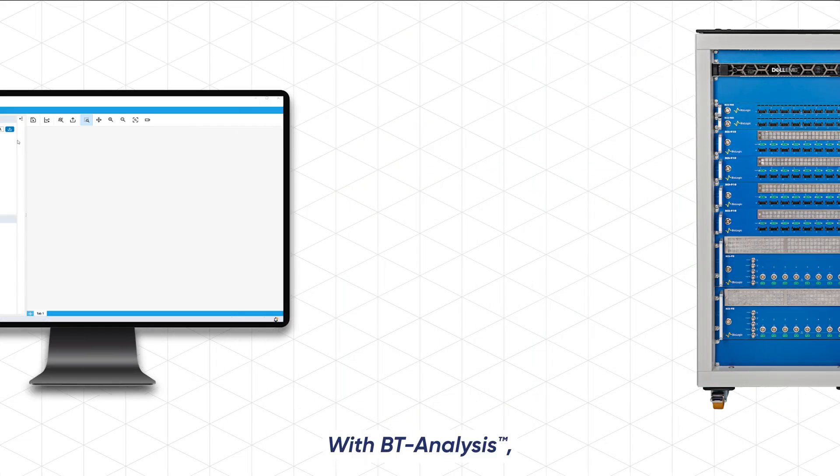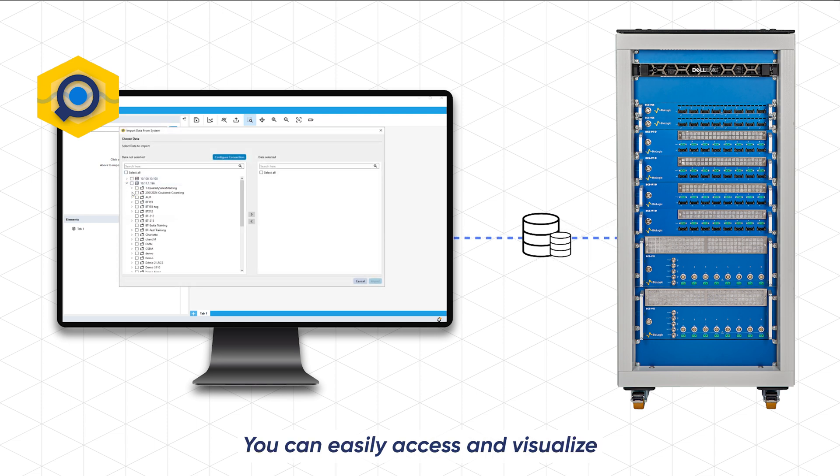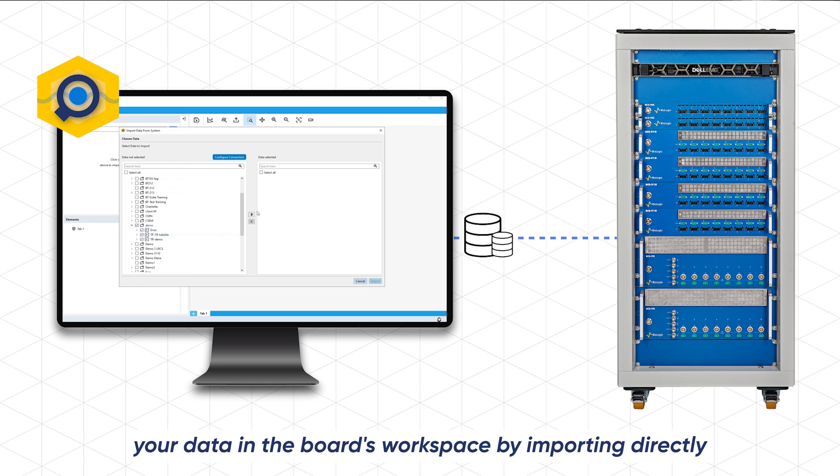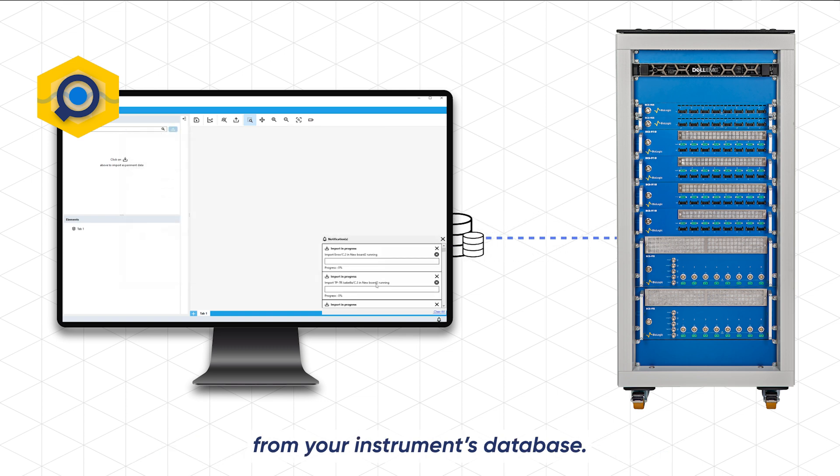With BT analysis you can easily access and visualize your data in the boards workspace by importing directly from your instruments database.